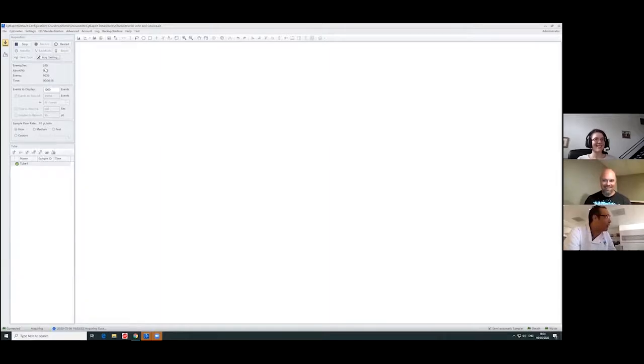It's like when you have the TV, it used to be a TV like this. Now you have the plasma, you can see all of this. So you don't need to play too much with the voltage. Now we recorded here 10,000 events, and you will see more or less everything is in the right place. I just started from scratch.